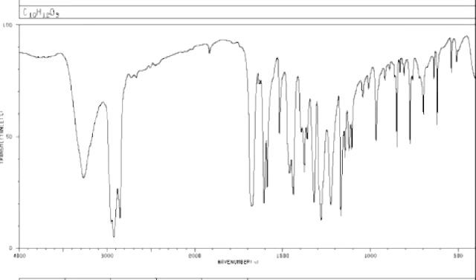So I included this compound just for a little bit of practice. Go ahead and take a look at the molecular formula, and pause the video here and take a stab at what you think this might be, and I'll look at it in just a second.